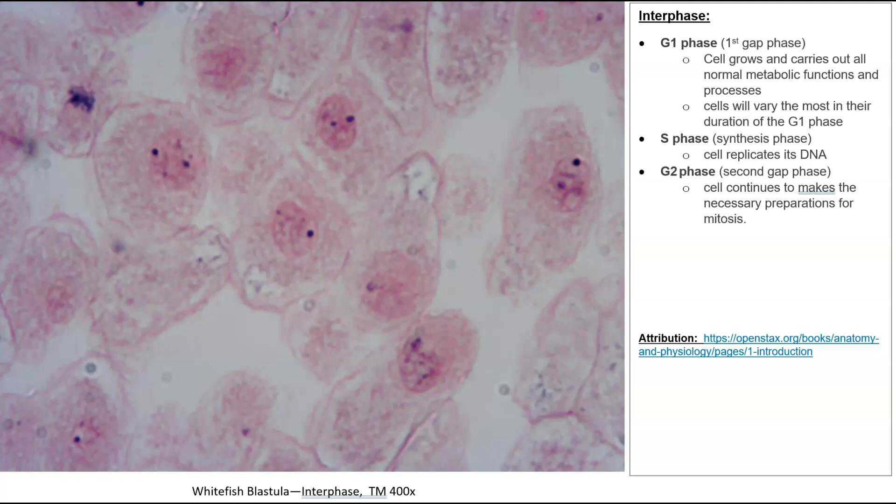Did you figure out what the interphase cells are? There are several in this slide, and I'm drawing red arrows so you can see which ones they are. How do I know they're interphase? I can clearly see the nuclear membrane is still intact, I can see some nucleoli — those dark dots in the nucleus — and many cells have two or three very visible nucleoli. The chromosomes aren't really clear because they're still in the chromatin phase. Over here we can see clear chromosomes; that cell might be in metaphase, but not the ones I've indicated as interphase.